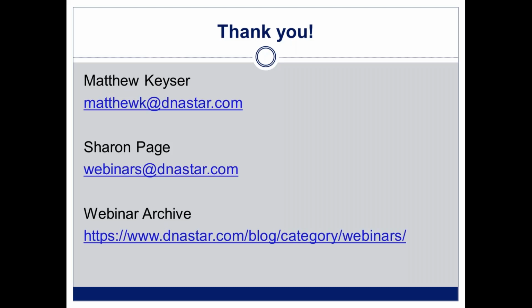And so that's something that we help our customers with all the time. If you have a database from Green Genes or some other 16S database, we can help modify the headers so that your analysis is a lot easier. You know, the names show up that are human readable. So again, it's something that we do with our customers all the time.